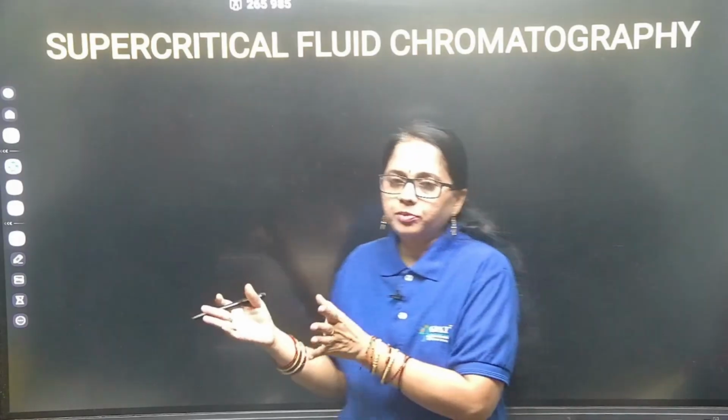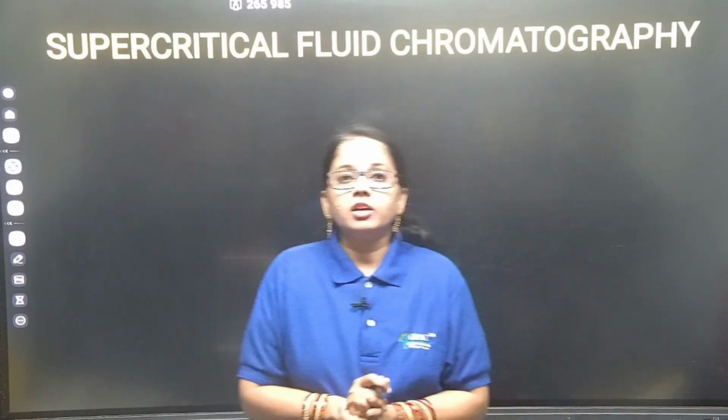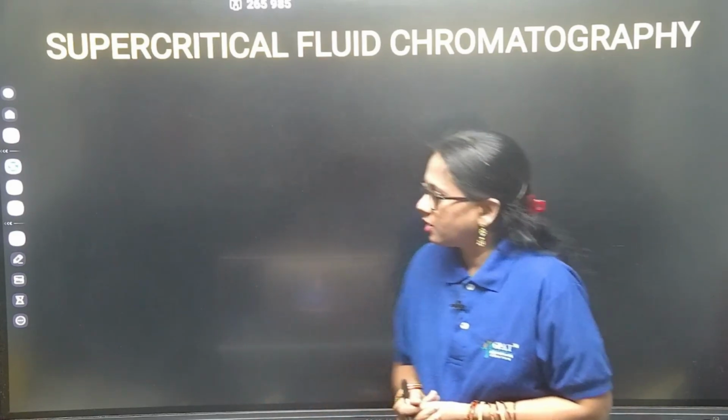And from the past 3 to 4 decades, HPLC is playing a very key role in the separation of pharmaceuticals. Not only in the pharmaceutical field, in most analytical laboratories this is also a widely used equipment, and the technology has developed, and now we are going to use ultra performance liquid chromatography also. That means the column is going to play a different role there. All these liquid chromatography techniques are based on the plate theory and rate theories, based on the flow rate as well as the number of plates available.